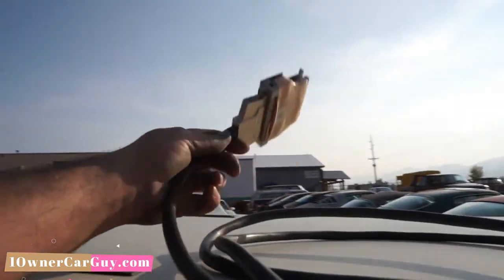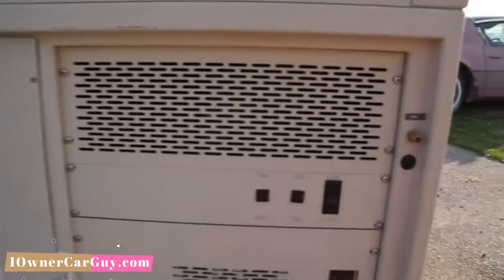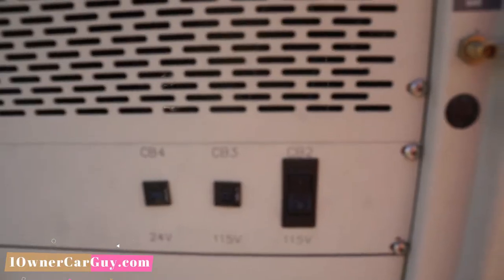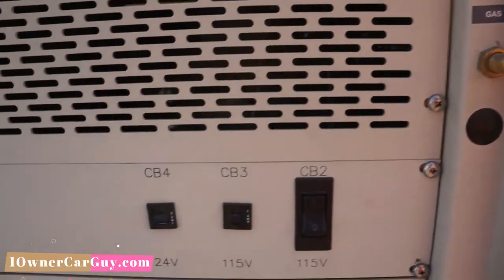I've got this cord here — everything plugs into there. I'll show you all the computer and stuff over here. You can set it to 24 volt, 115 volt. CB4, CB3, CB2 — I don't know nothing about that. I've heard of CB4.